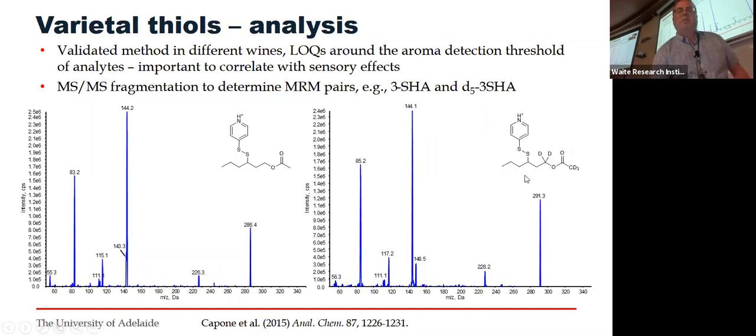Their only difference is the molecular weight, or the m/z that you get for these. So you can see that's 5 mass units different. Often that will carry through in the fragments as well, but it depends how this molecule fragments. So it falls apart at this bond here, and that leaves that 144. And when that fragments, we get down to a 111 or an 83 or whatever.